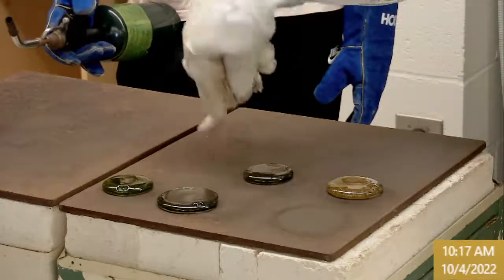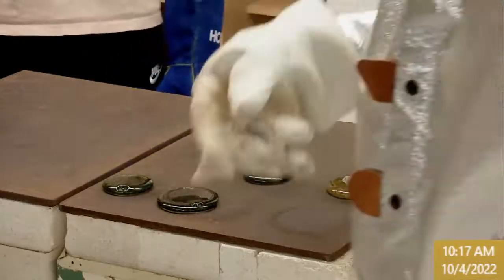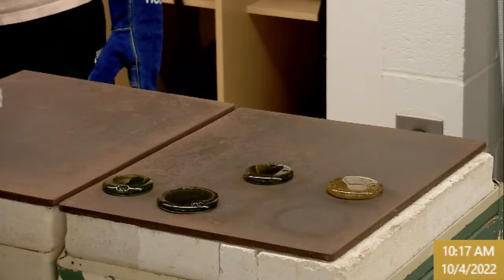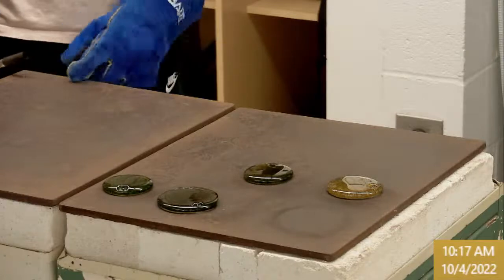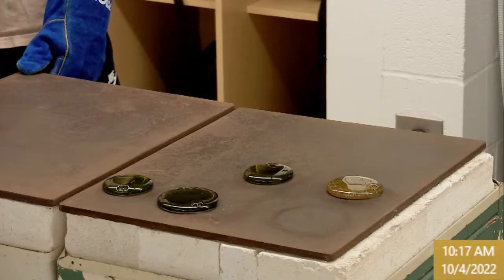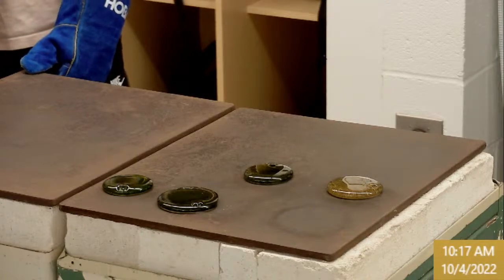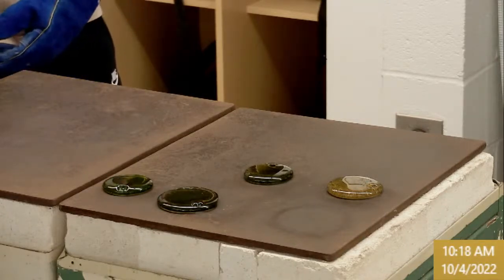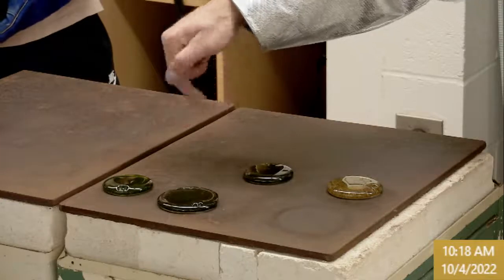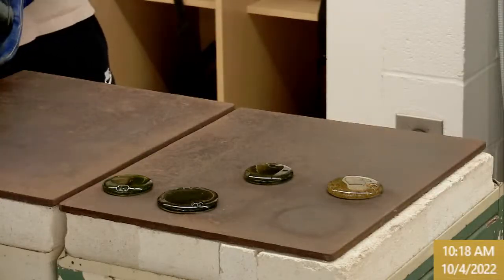All right, so we'll cast here, and I think that if we angle back this way, I'm going to move these crucibles, give them more real estate on the back end here. That way you can angle back, since it's more temperamental today. So F2. Again, it's the Michigan sand, 90 grams, washing soda, 53 grams, crushed limestone, another chrome oxide, 0.14 grams. So it seems like we'll have lots of shades of green here today. Angle back that way, I think we should be in good shape. So pulling from the middle, F2.